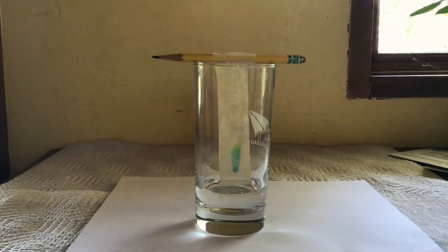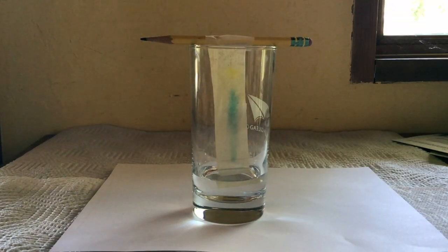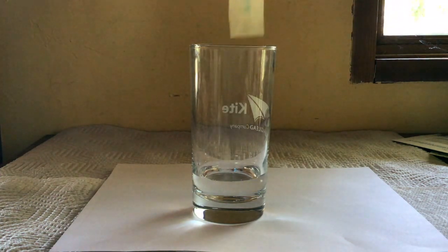We're now in fast motion watching the water separate the green food coloring into the original dyes it was made from. The more soluble the dye, the faster it will be moving up along with the water. The chromatography paper has been in the water for about half an hour and hasn't quite reached the pencil line, so I'm going to go ahead and take it out.